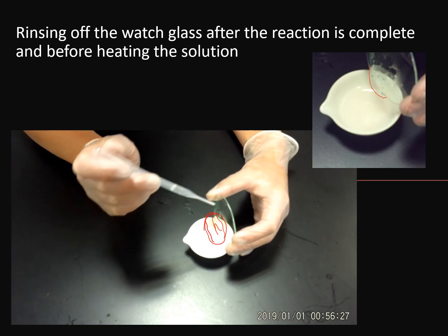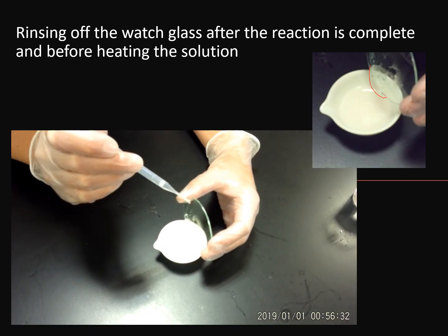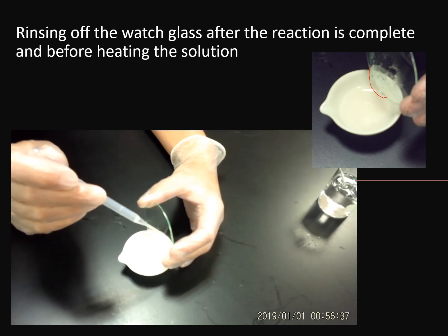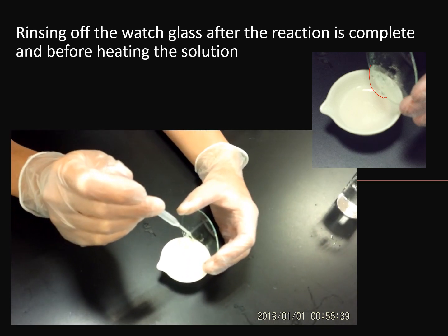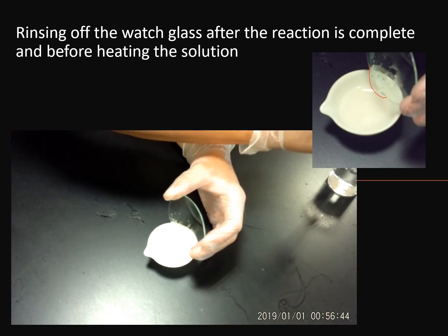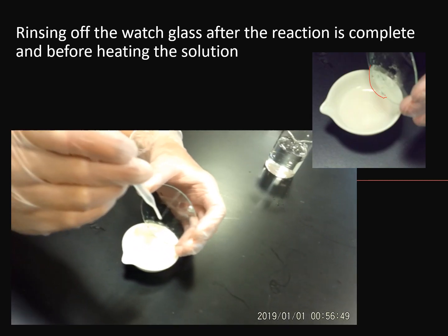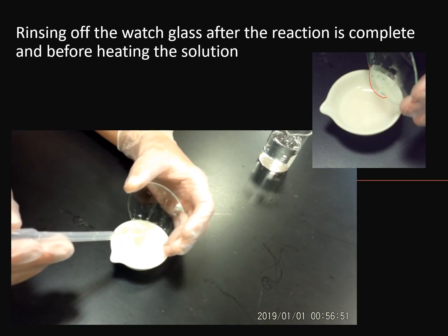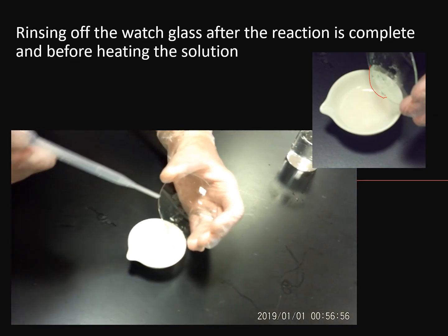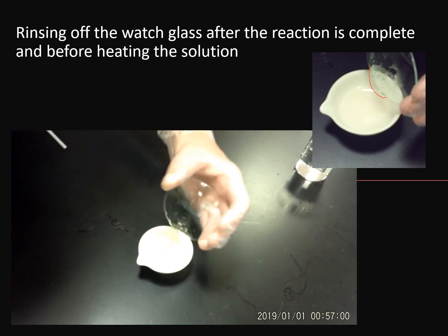So to clean the watch glass, we use about 1 mil, no more than 2 mils of DI water, and 1 mil is about 20 drops. So we'll just count the number of drops, and all you're going to do is put a few drops of DI water to wash off whatever was sprayed on your watch glass and let it go right into your solution. Now, will you be able to get rid of all of the DI water here? No, but the goal is to try to get as much of your product back in solution.